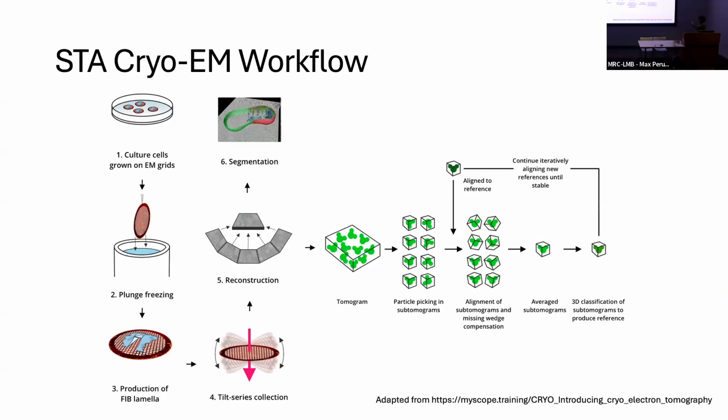You use a tomogram and then do the averaging. Then you do a lot of 2D and 3D classification to build the model. In this way you go to the single particle approach and improve the resolution. This is why some people can already go to 3 Å, which is a very good achievement. So I will end up here.